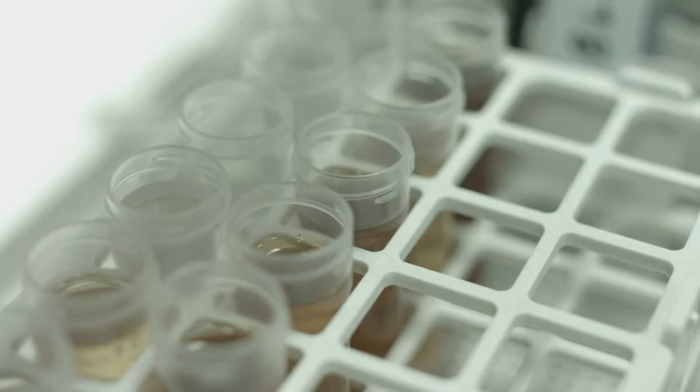For even more challenging sample matrices, there is the option to use either fully automated liquid dilution or dilution using argon gas.